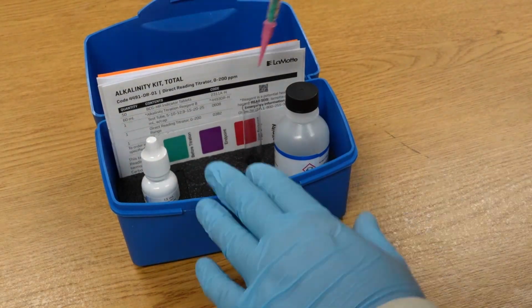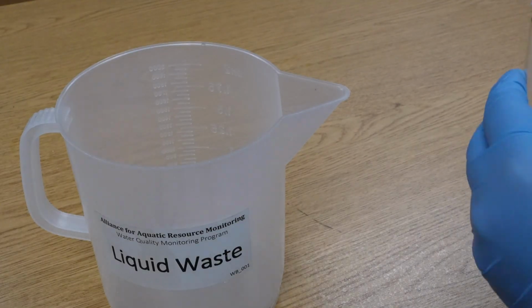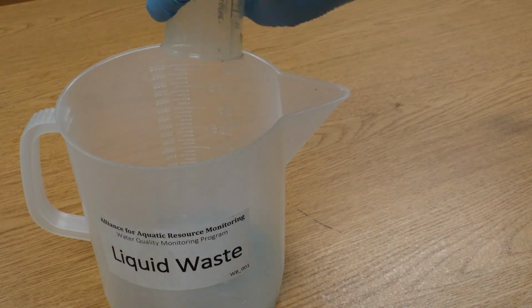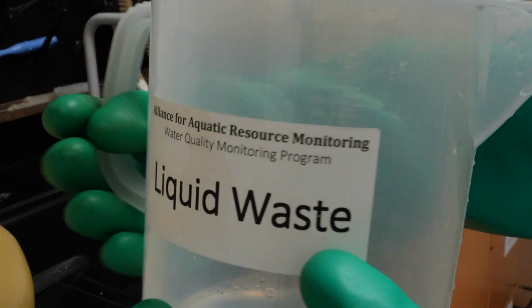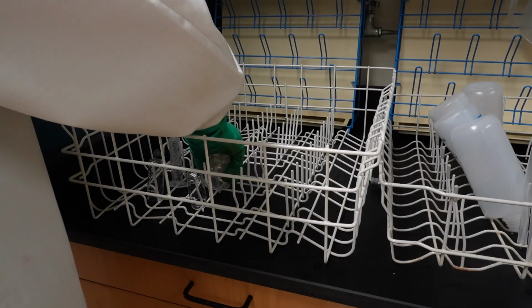Once you have completed your replicates, it is time for cleanup and rinsing. Pour the solution from the titrated vials into your waste bucket, as well as any extra sample water in your beaker. Turn on the cold tap as you pour the liquid waste down the drain. For information on how to acid wash your equipment, please check out the video on our YouTube page.